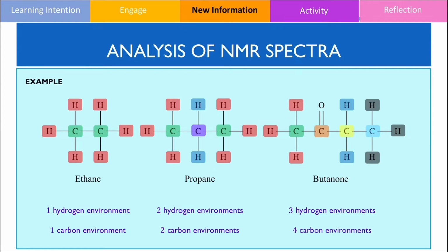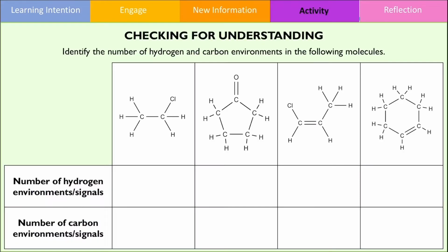Although I have yet to fully explain the principles of NMR spectroscopy, I want you to see if you can identify the number of carbon and hydrogen environments in the following molecules. Pause the video now and resume again when you've got an answer.